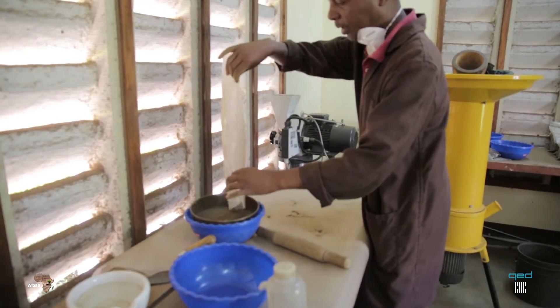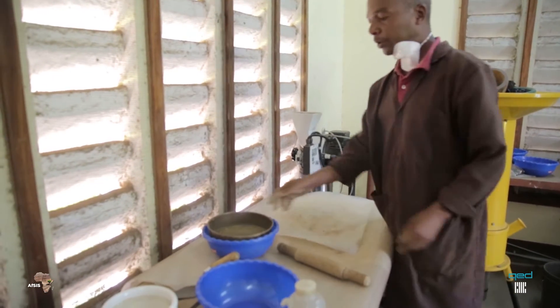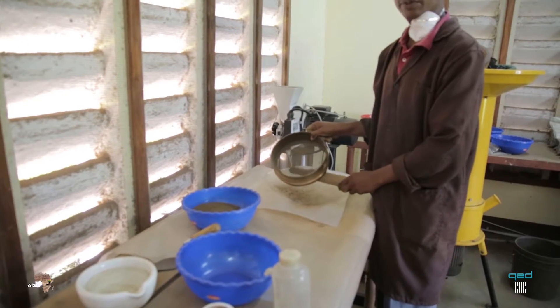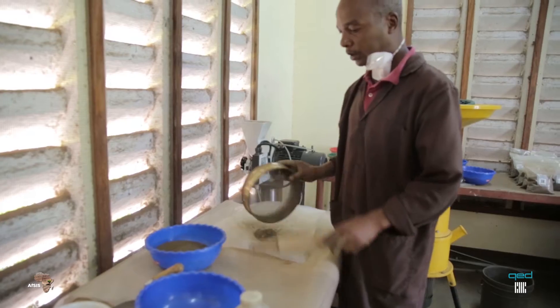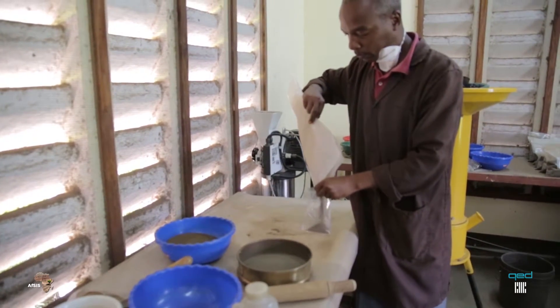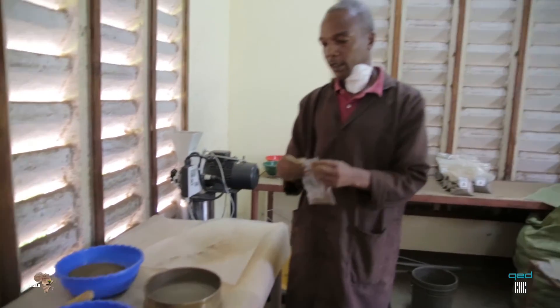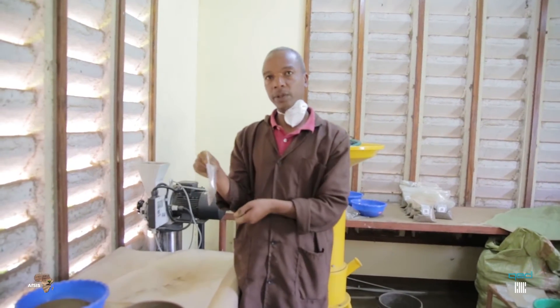Turn to the sieve mesh. If you see here, what is remaining — this is the coarse fragment. Later on, we are going to measure the weight of the coarse fragment we got from the fine soil.